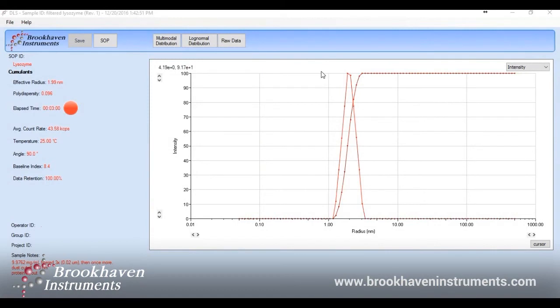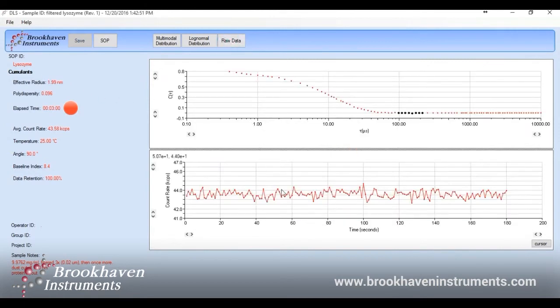The results for the freshly filtered sample without a dust filter setting on are much better than before filtering, but still have some evidence of larger particles as seen by the count rate history. The measured size is 1.99 nanometers.